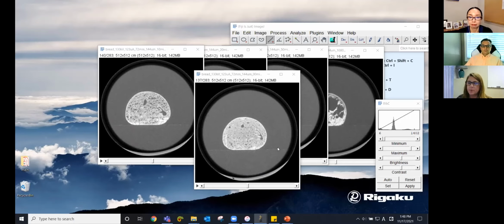The poll question has now been launched, and we want you to pick the easiest way to repeat this procedure for all 5 of these image stacks. Do you think you should write down the procedure and make sure it's applied in the same way to all the stacks? Or do you recommend writing a program to execute the procedure, perhaps in Java? Or do you think we should record the procedure as a macro on the first stack and then run it on the remaining stacks? This question might have been too easy. I think it was a leading question.